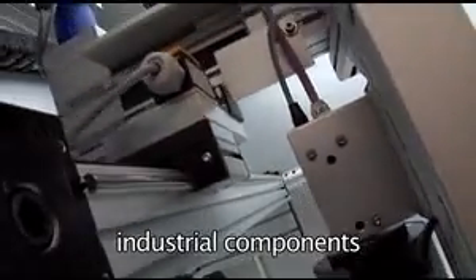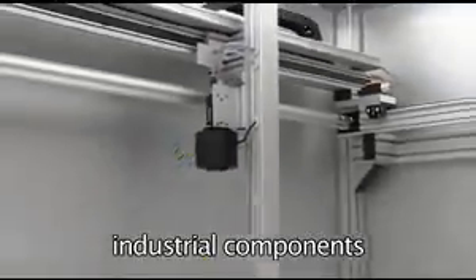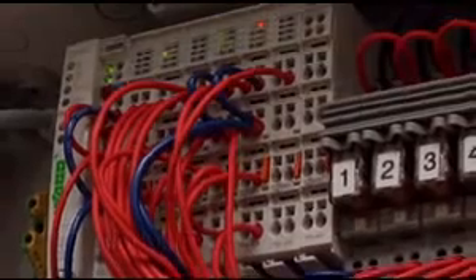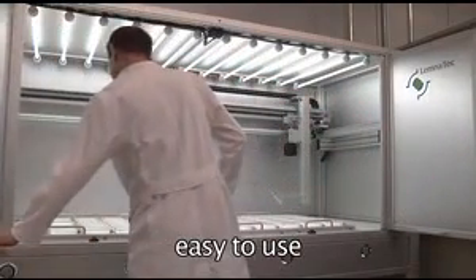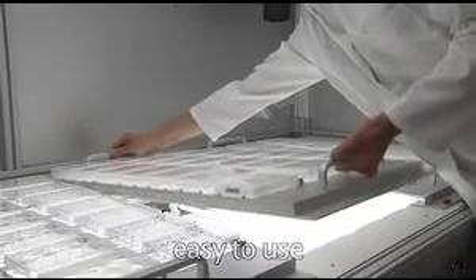Lemnatec exclusively uses standard industrial components that are easy to maintain for all its hardware components, with worldwide service support. All vessels and micro-titer plates are accurately positioned in customized multi-vessel trays, allowing for easy access to all vessels and also for quick removal.